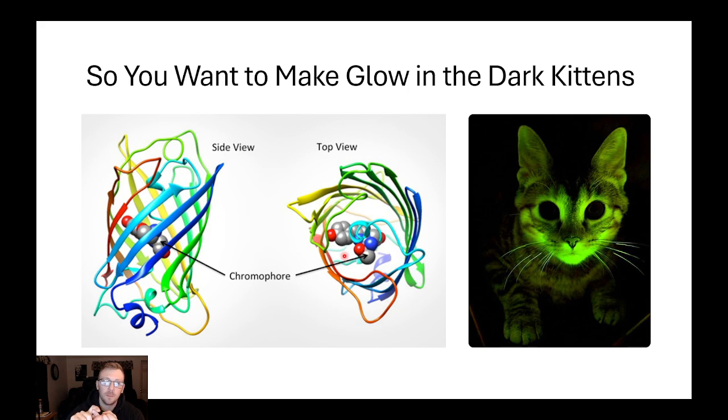But also, we can genetically encode fluorophores. So CRISPR-Cas9 has been a second major revolution in not only imaging biology, but biology as a whole. We can CRISPR in fluorophores onto genes of interest that then, when that gene of interest is turned on, will append this fluorescent molecule to that protein that will be expressed in the cell, and we can then look at it.